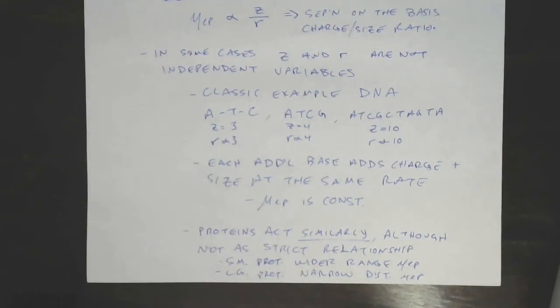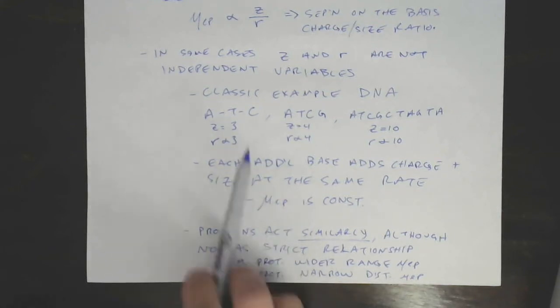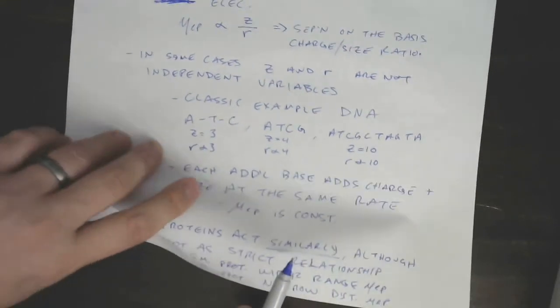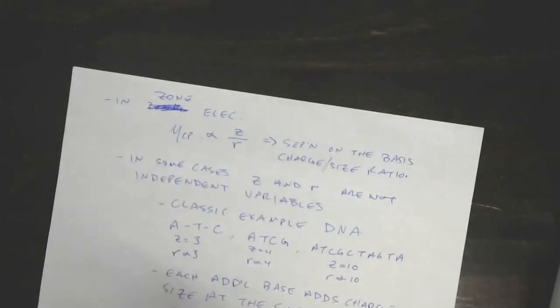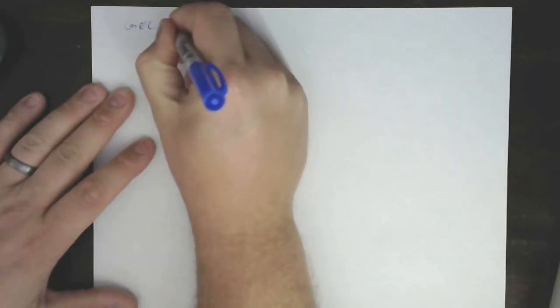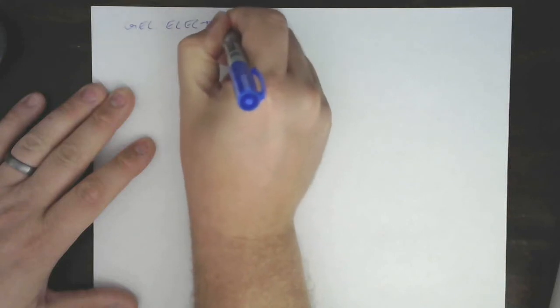So what's the solution to this? The one thing we do know about these large proteins and about these DNA molecules as they grow is that their size changes, even if their size to charge ratio does not. And so what we need is a mechanism for separating these molecules by some of these very simple electrophoresis processes, but one that is selective for size, not size to charge ratio. And that is where the concept of gel electrophoresis comes in.